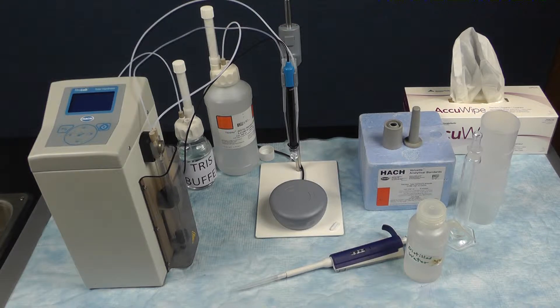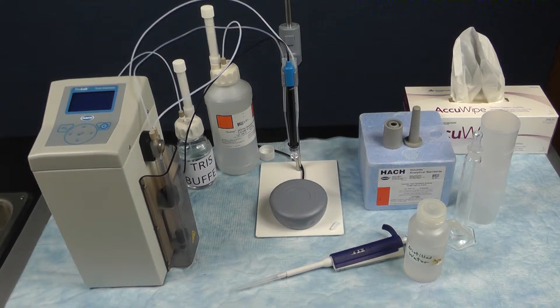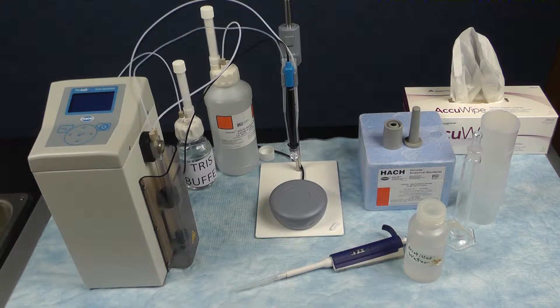Total hardness is determined by the concentration of multivalent cations in water. The Hach TitraLab measures these ions by titration using a calcium ion selective electrode and EDTA as the titrant. In this video we are going to show you how to operate the Hach TitraLab for total hardness.